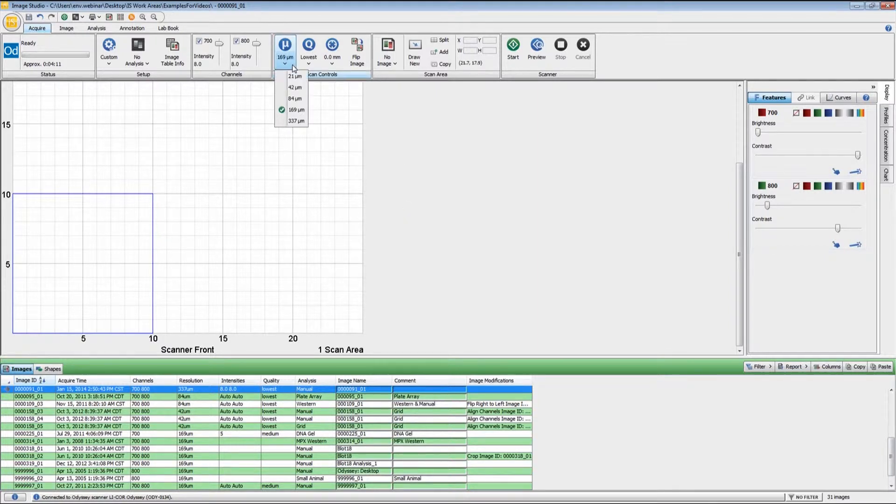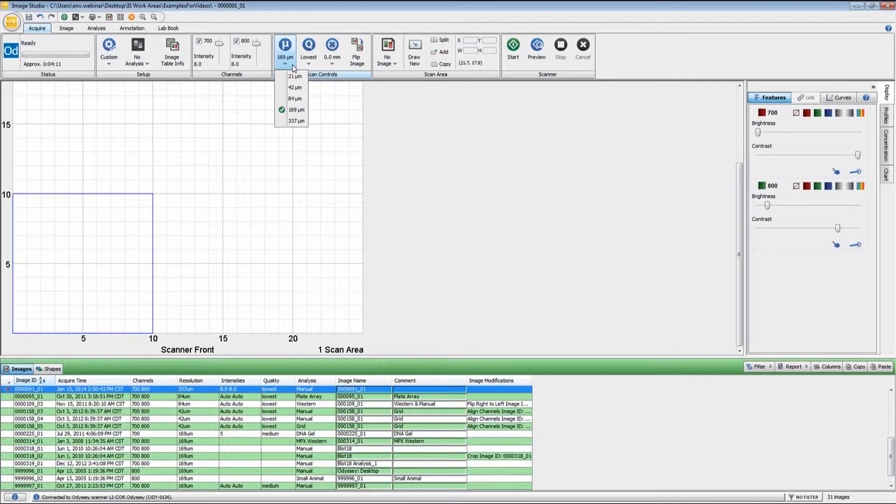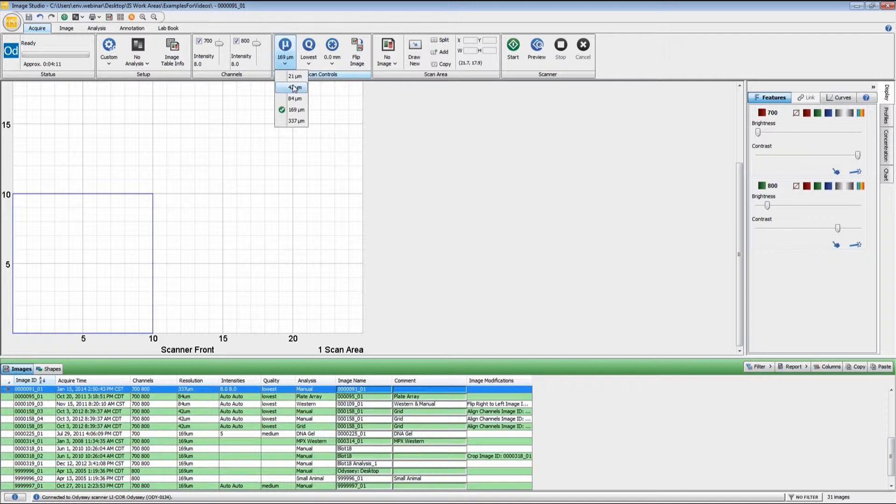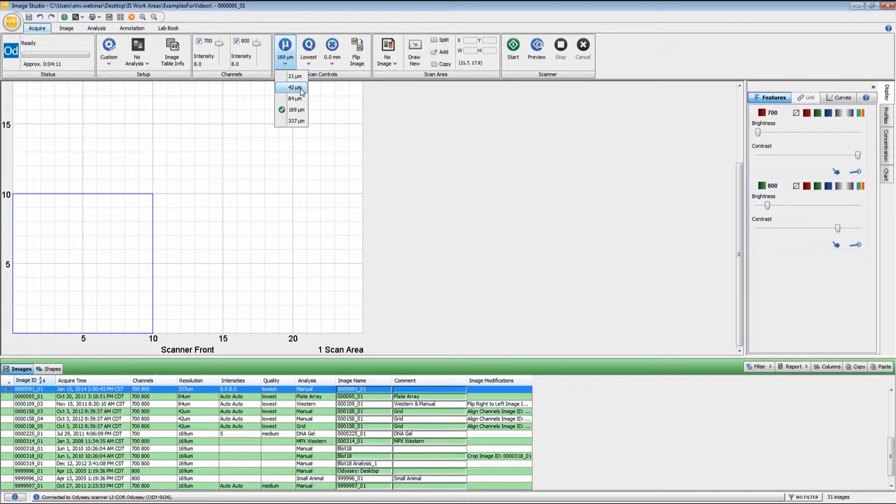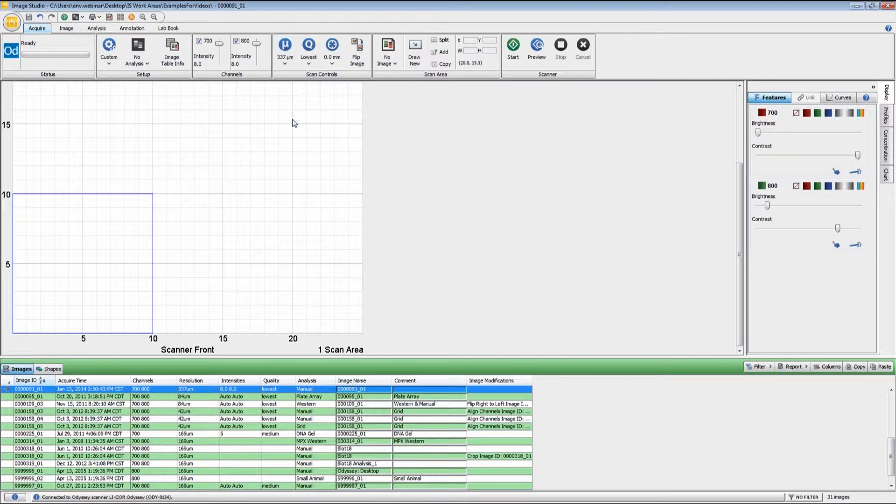There are five resolution settings that range from 21 to 337 microns. This is a measurement of how large each one of the pixels are going to be. A larger number means you're going to have a larger pixel and lower resolution. Generally for Western blots, we would recommend either 169 or 84 microns. The higher resolutions are really for applications such as arrays or tissue sections. For plate-based assays, 169 is generally what you will want to use. For demonstration purposes, I'm going to do a 337 micron scan just so you can see what scanning at too low of a resolution will give you.